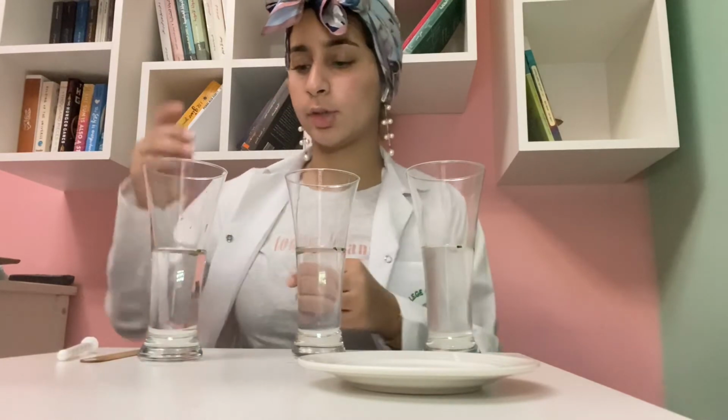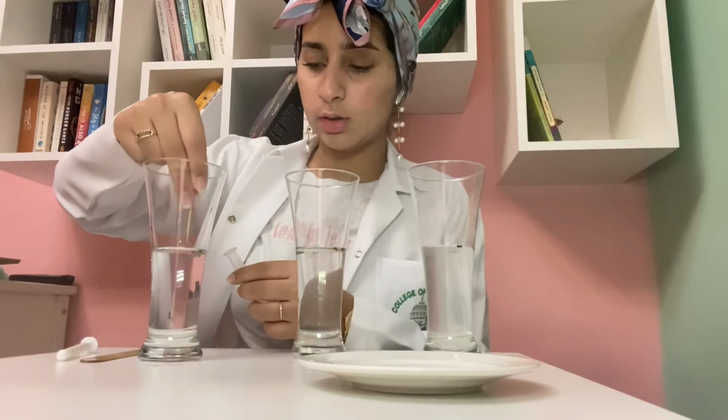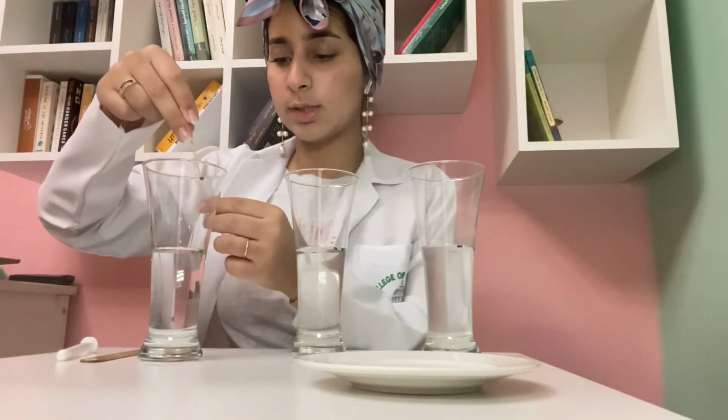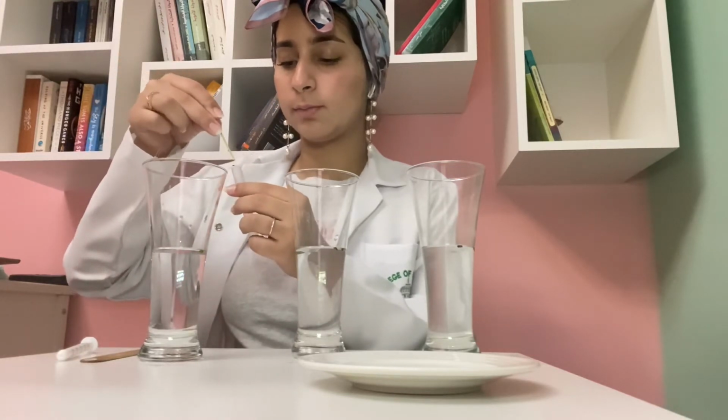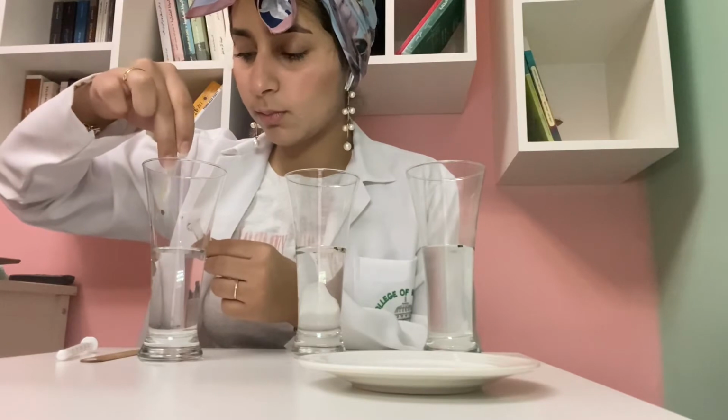In order to make them sink, we're going to use the syringe. We're going to do the same process for all of the 3 different concentrations. We're going to put the discs inside the syringe after removing its cap. This is the first disc. This is the second disc.